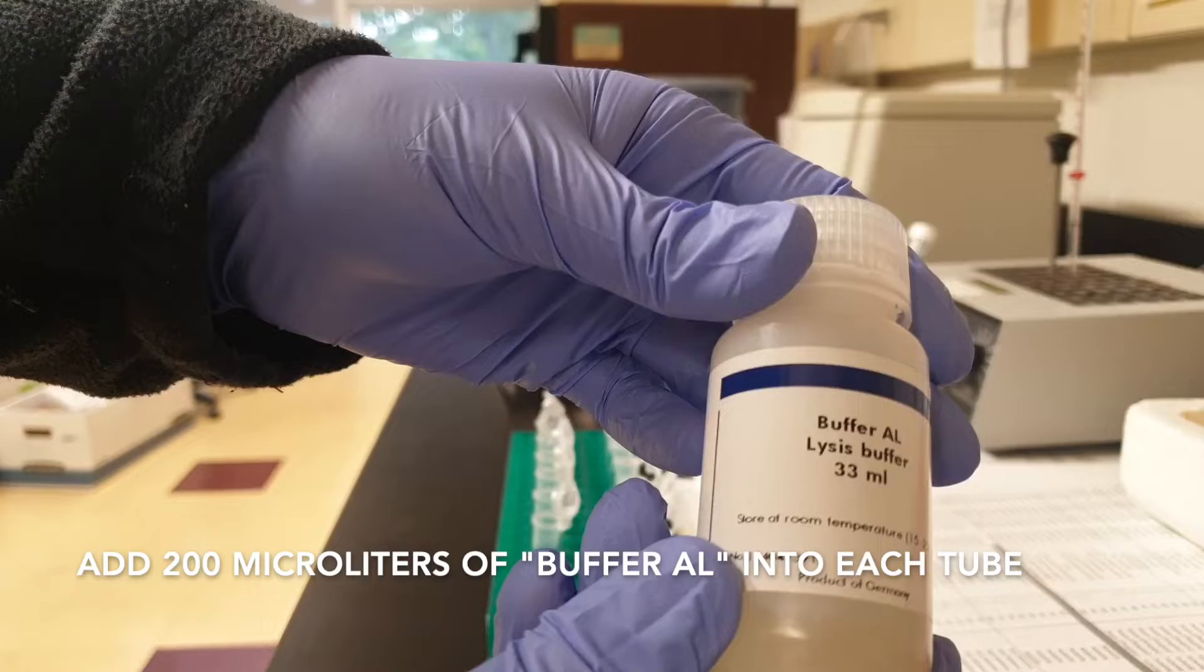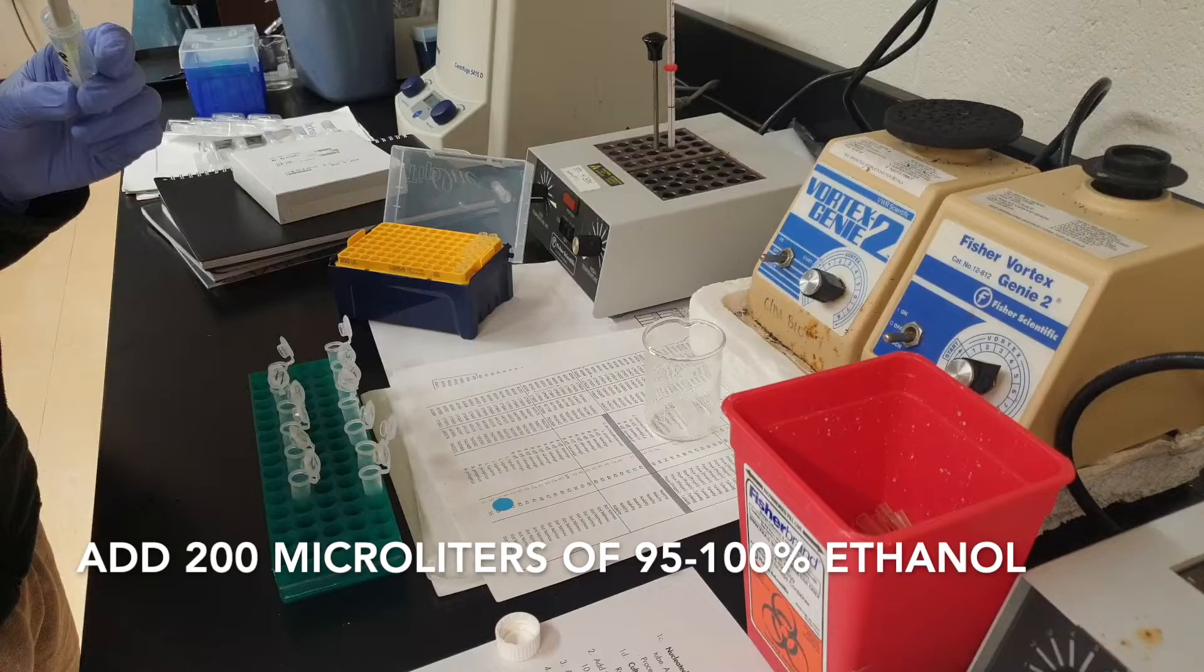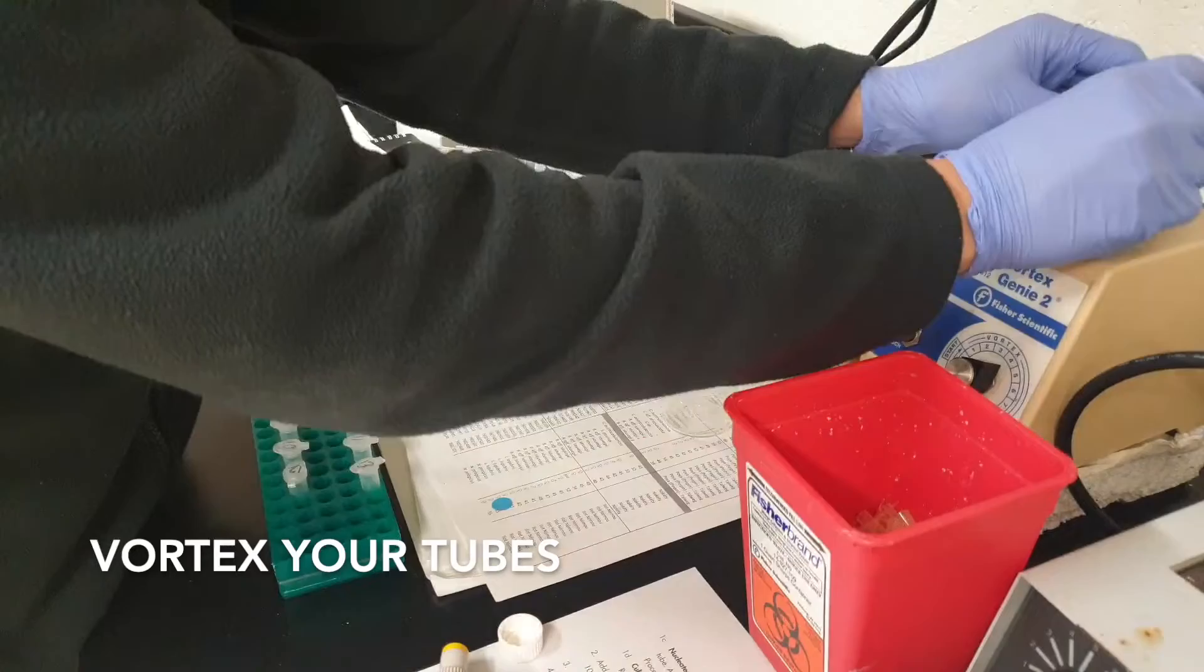Once that's done, add 200 microliters of buffer AL and 200 microliters of pure ethanol. If you don't have pure ethanol, you can use 95% as well. In the end, you're going to have about 600 microliters of solution in your tubes.